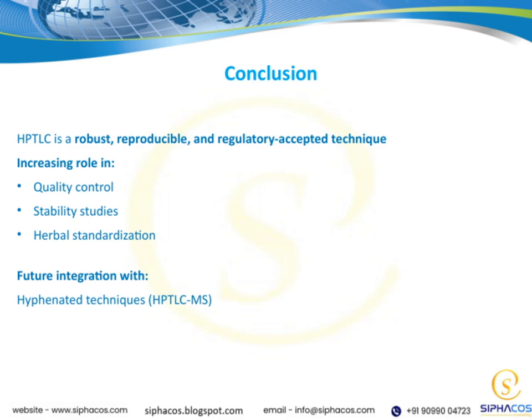Looking ahead, I see exciting possibilities with the integration of HPTLC with other advanced techniques, such as hyphenated methods like HPTLC-MS. This combination will enhance our analytical capabilities even further, providing more detailed and comprehensive data. Overall, HPTLC's versatility and future potential make it an invaluable tool in our analytical toolbox.